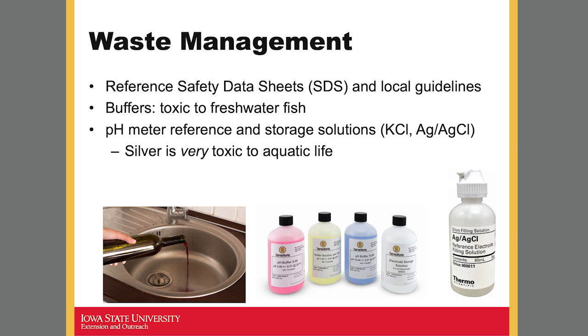So lastly, the waste management. Again, just being comfortable and familiar with the stuff that you're working with, referencing your safety data sheets, or SDS, and your local guidelines. So the SDSs either come with chemicals that you order, or you can easily just Google SDS and the chemical name pops right up. Try to look at the ones specifically for the same manufacturer, even though several manufacturers will make sodium hydroxide, for example. So today, specifically, we're going to be looking at pH buffers.